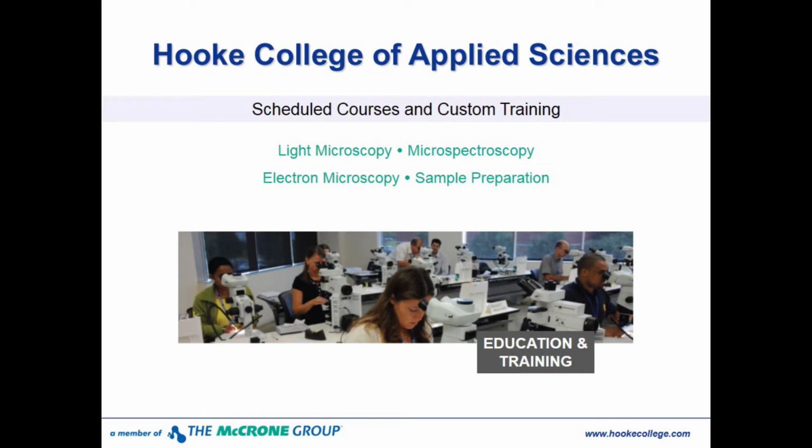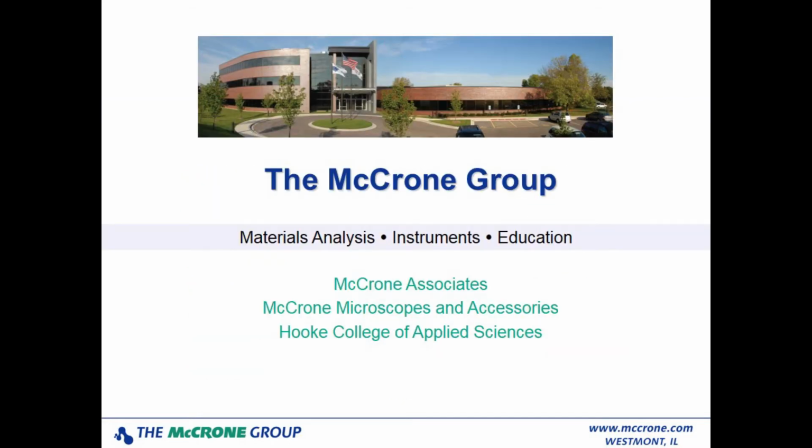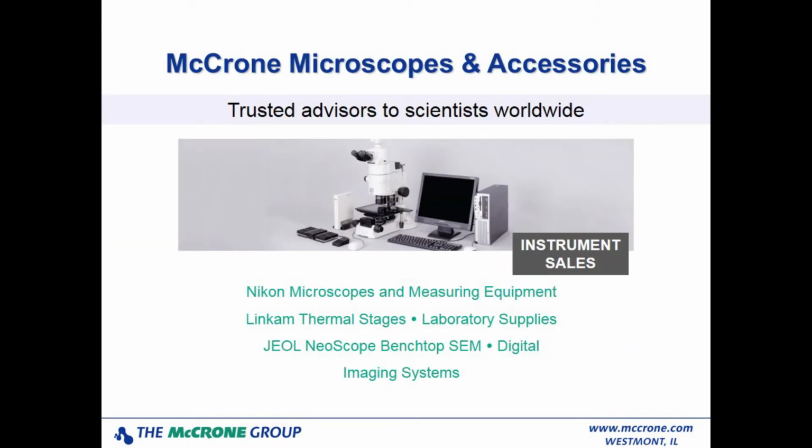I don't know. It kind of depends a little bit, I suppose, on the type of analysis that it is. If you look at it and you think it's pretty simple, we'll say a nylon fiber or something, I might go along with that. But otherwise, I think you have to have some information in order to get started. I know it seems a little strange because people will say, well, what would you like the answer to be? In other words, the analyst or the microscopist might go back and say, well, what kind of answer do you think this should be? I really like the idea of this close communication between the requester and the person doing the test to go back and forth. I think you get the best result like that.